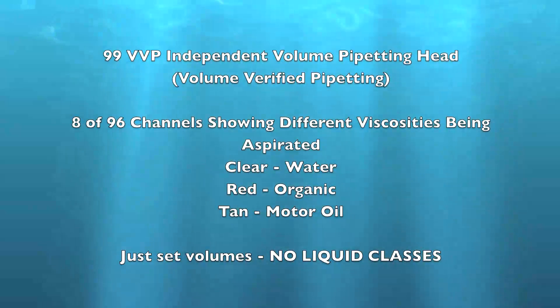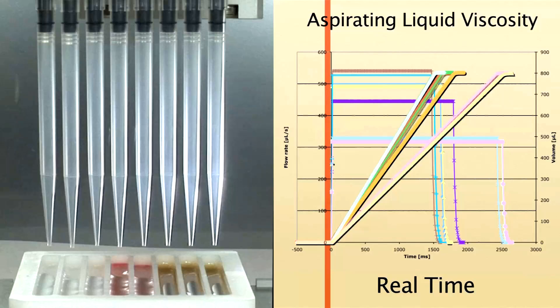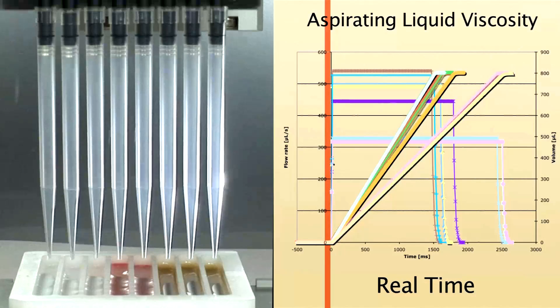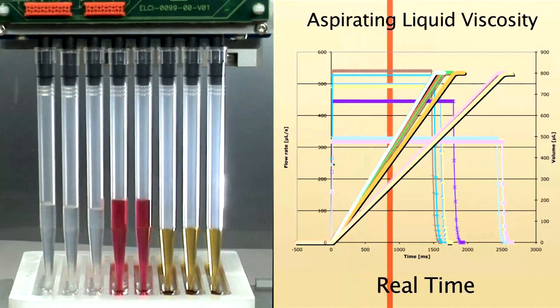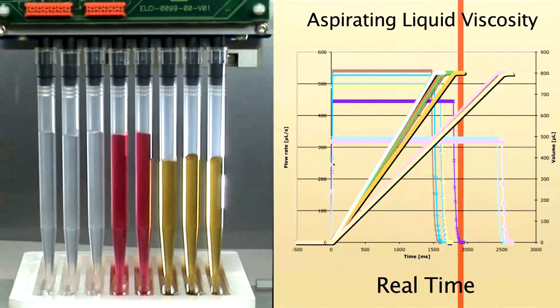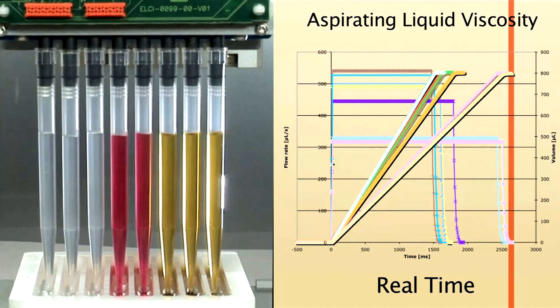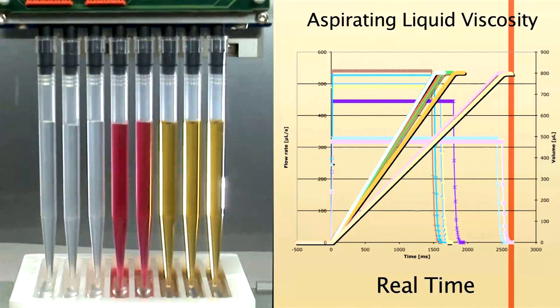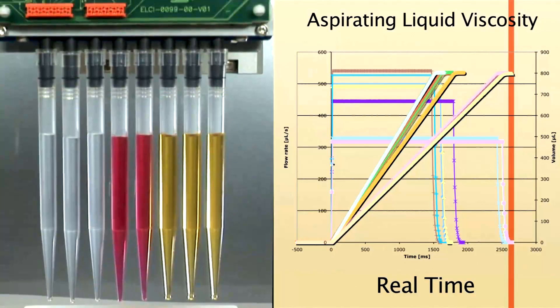In this next clip, we show 8 of the 96 channels pipetting liquids of different viscosities. Here we show water in clear, an organic solvent in red, and motor oil in gold. There are no syringes responsible for liquid transfers — liquid is actually monitored and measured volumetrically as it enters the tip. The electronic board shows we are doing sensor-controlled pipetting; we basically just set a target volume of 800 microliters, and the more viscous samples will take longer to enter the tip until the solenoid valve actually shuts off when the target volume is met.